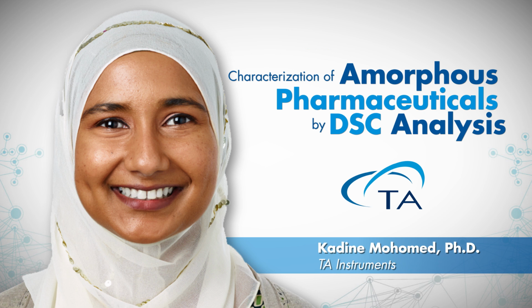So the DSC is giving you the total heat flow, the sum total of the heat flow of all the components and all the events that are taking place. So let's say you have one component that is amorphous, the other one that is crystalline or semi-crystalline. If the amorphous content is of a low weight fraction or volume than the crystalline, then you're going to have less of a heat flow associated with that glass transition of the amorphous material or component in that mixture.